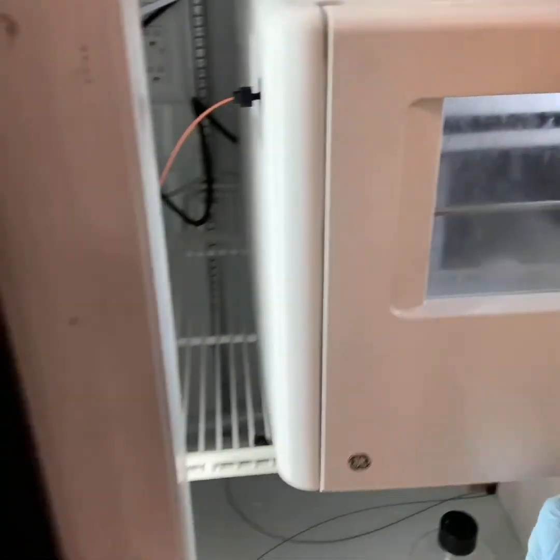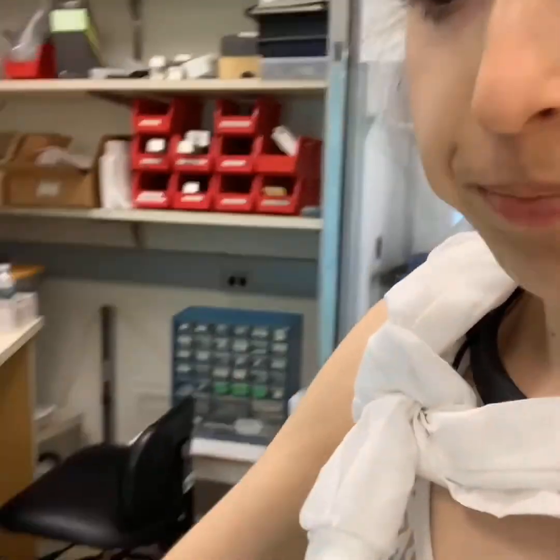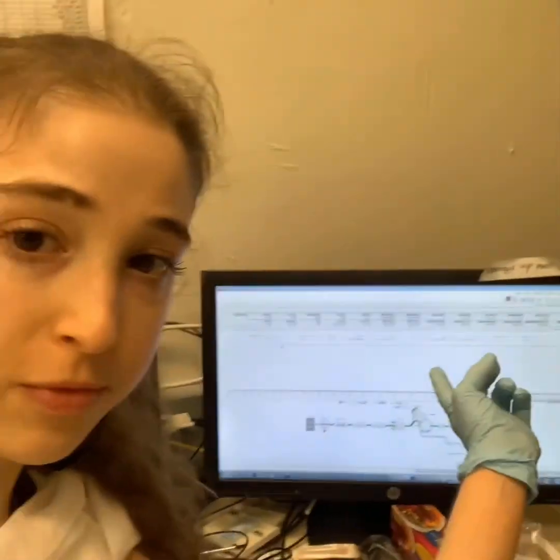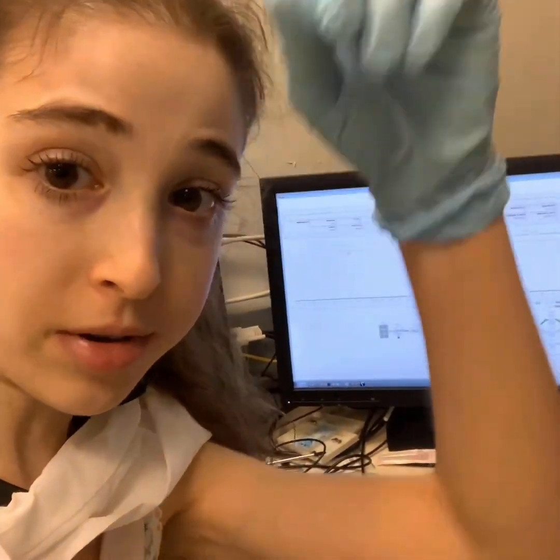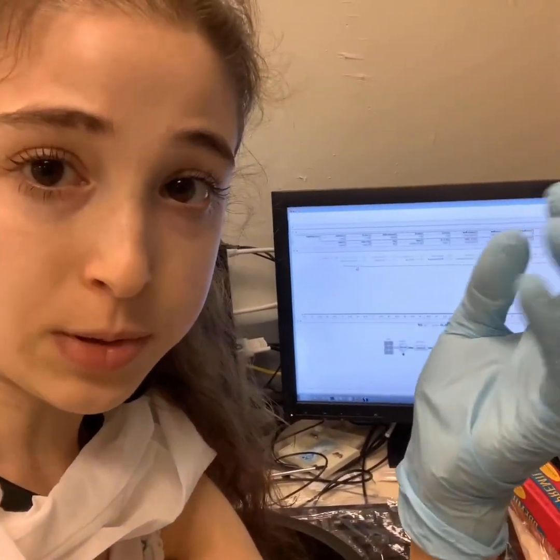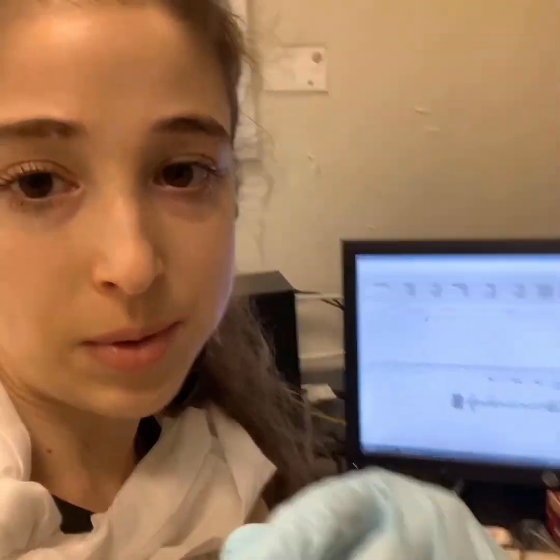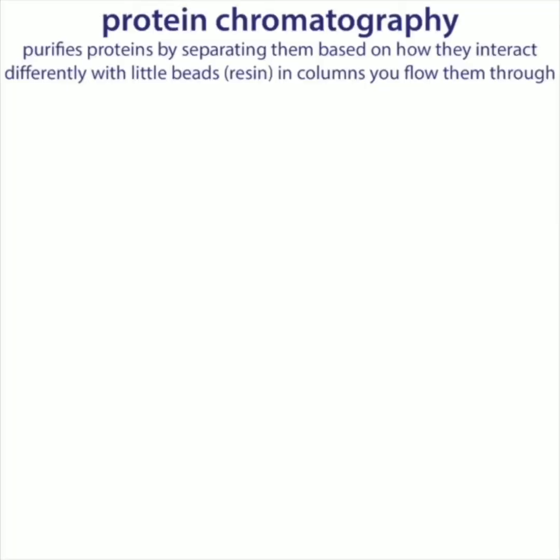After they go through the column, they're going to go through a UV detector. And once they go through that UV detector, they come out into this little fraction collector, which is going to collect the fractions in a deep well plate like this. I can look at the UV readout on the chromatogram, and when the protein comes out — because proteins absorb UV light — I'll see a peak and be able to correlate that with where the fraction is.